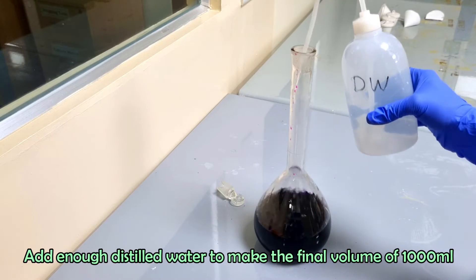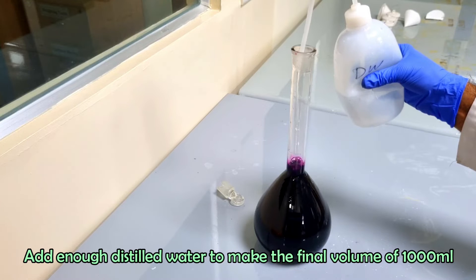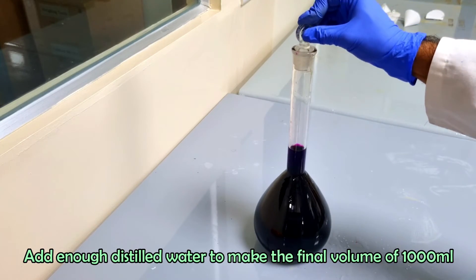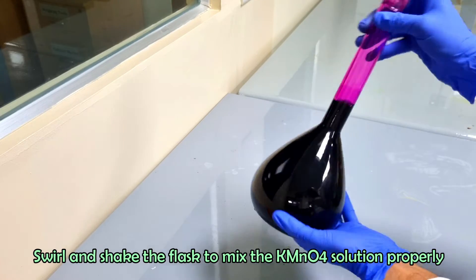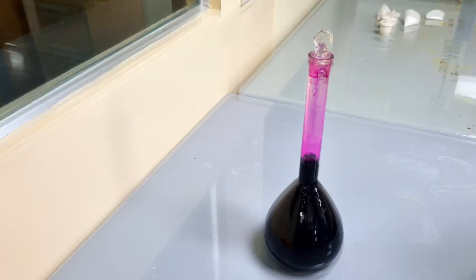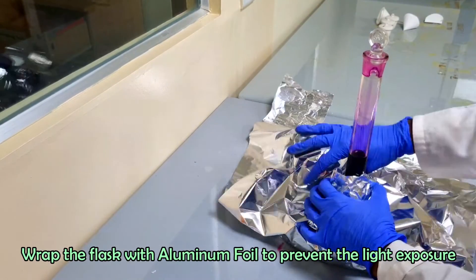Add enough distilled water to make the final volume of 1000 ml. Swirl and shake the flask to mix the potassium permanganate solution properly. Wrap the flask with aluminum foil to prevent light exposure and keep the solution standing in dark for two days.